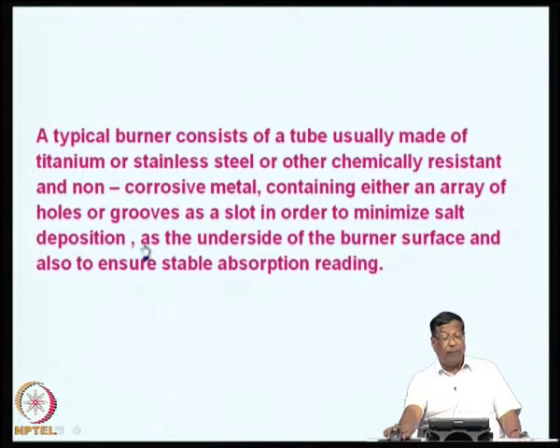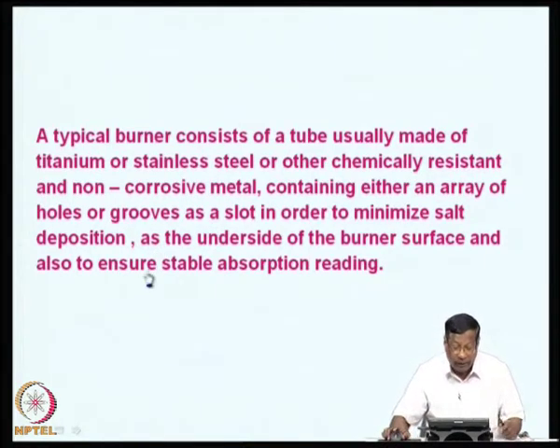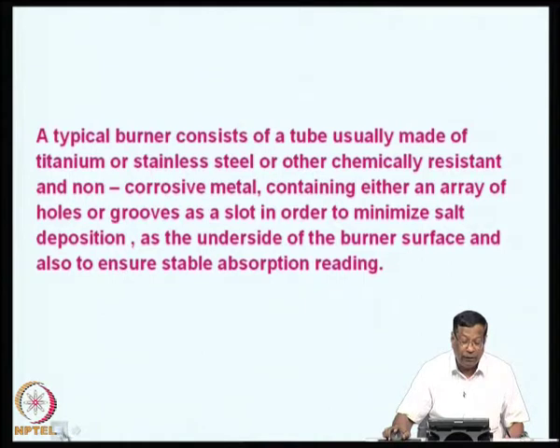They contain either an array of holes or grooves as slots in order to minimize salt deposition on the underside of the burner surface and also to ensure stable absorption.